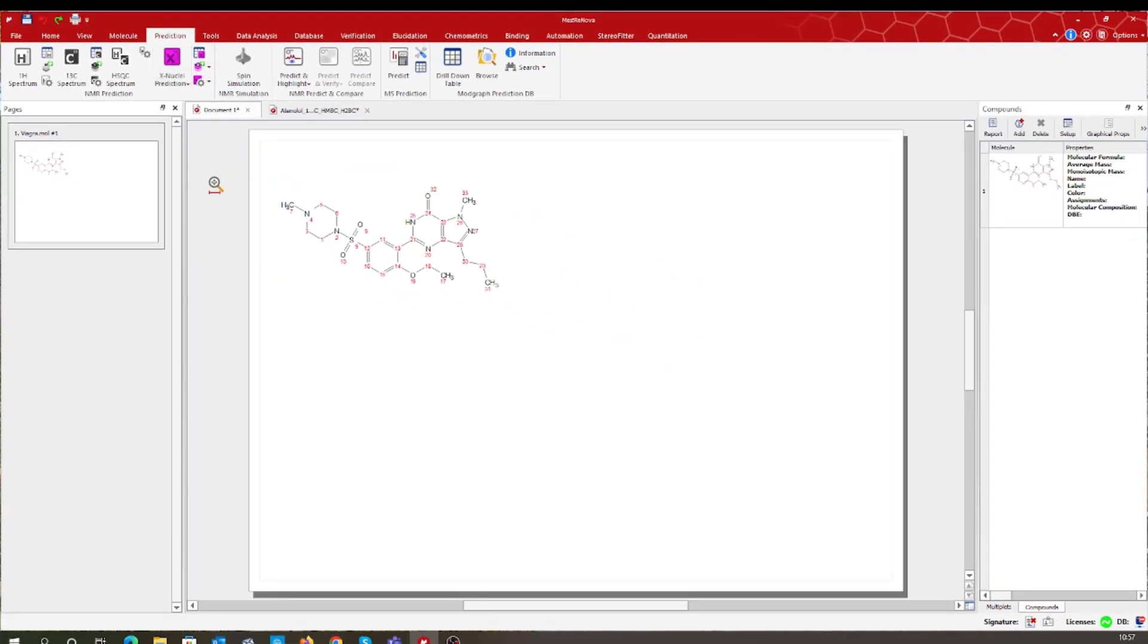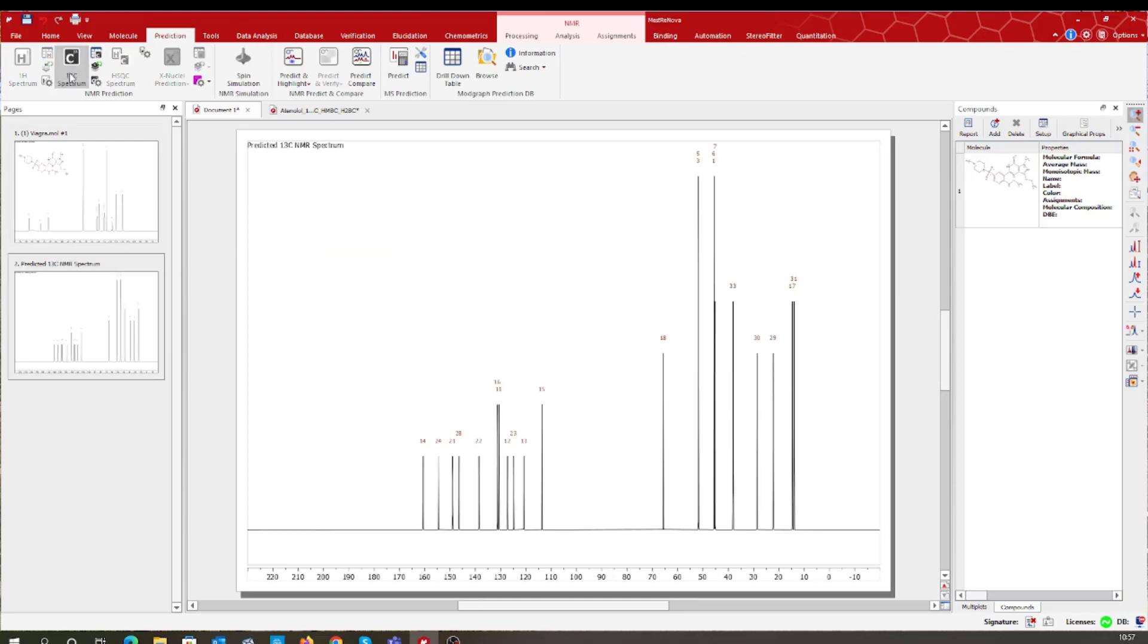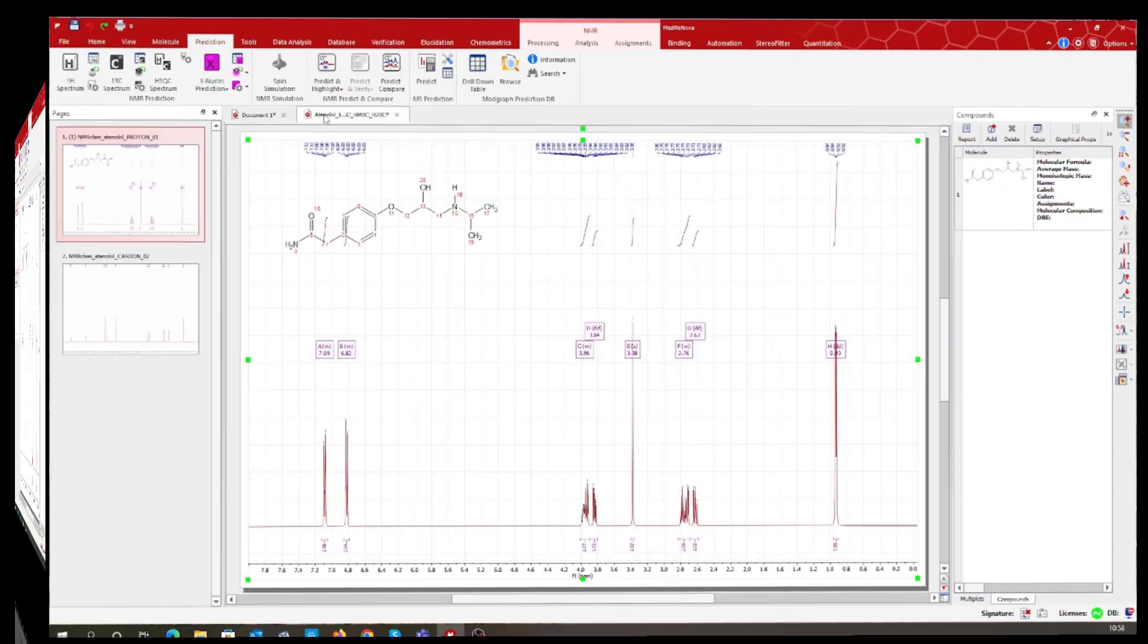Let's take the example of this structure which some of you may have already recognized as being sildenafil. In a couple of clicks you get access to the predicted proton NMR spectra and carbon-13 NMR spectra.